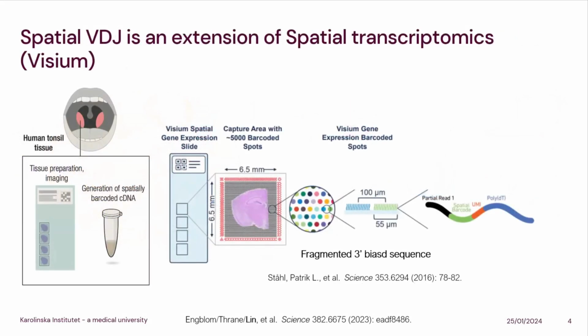For example, there is a recently developed approach, spatial transcriptomics. It is conceptually similar to the single-cell method, but uses a DNA array with a lot of spots, like 5,000 of them. They have oligos to capture the mRNA, do reverse transcription, and cDNA amplification.